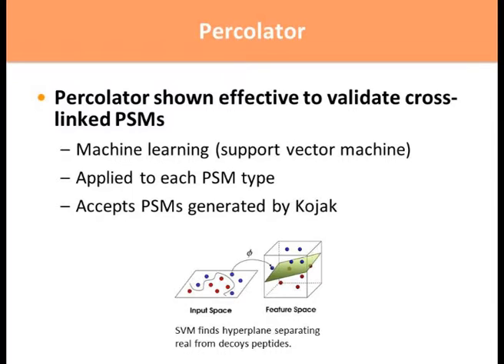There are about a dozen different parameters that it accepts, and so it has this n-dimensional hyperspace that tries to find the optimal separation between targets and decoys, and creates a hyperplane through that that is used to define your FDR cutoff. Then you set your threshold, say 1% or 5% FDR, and say, I will accept all peptide spectrum matches that are below that threshold.